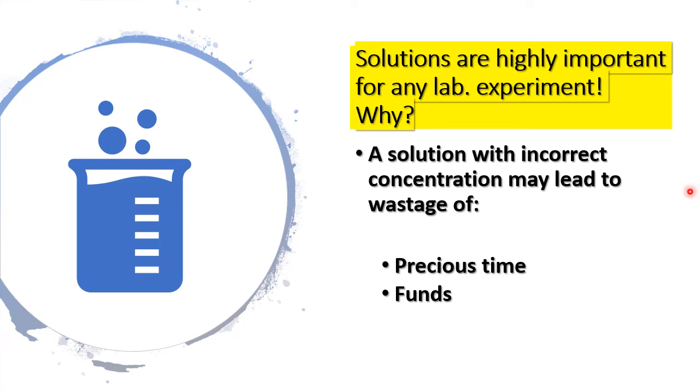In this lecture, I am going to talk about solutions. Solutions are highly important for any lab experiment, whether it is a molecular biology lab, biochemical, chemical, or analytical, or any lab where solutions are used. Why are these solutions so important?